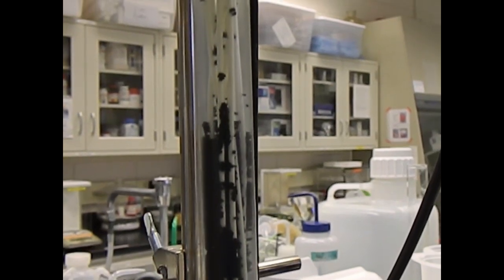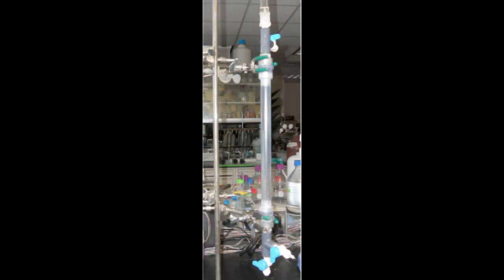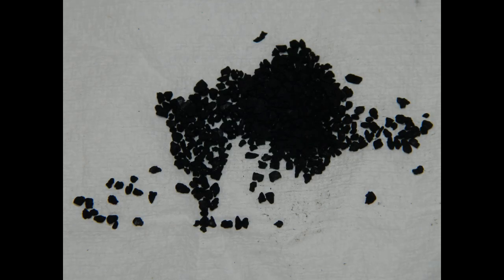And this is an example of the AFMBR. This is just showing some activated carbon particles. These are very small particles that are made out of many different renewable materials like peach pits, coconut bits, and things like that.